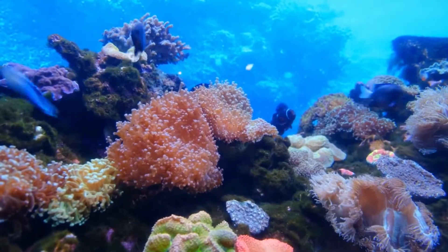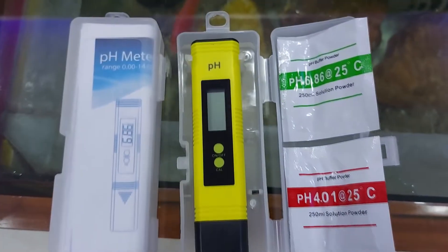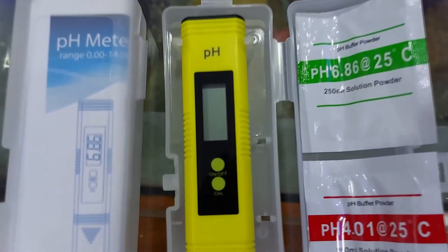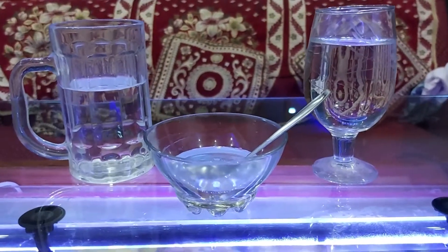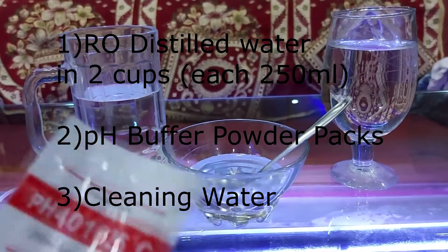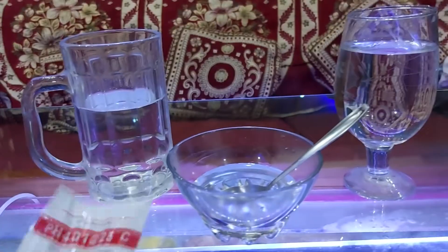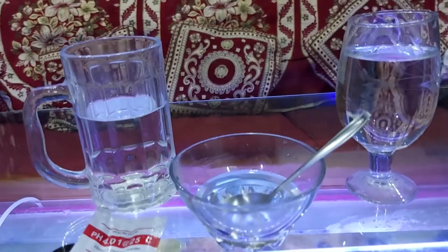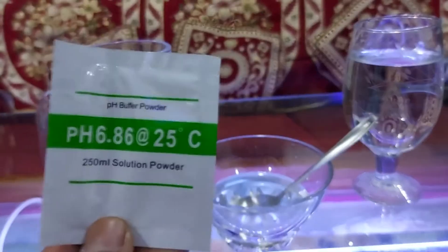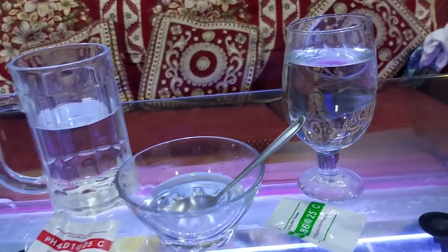Hello everyone, welcome to a new video of That Fish Place. In today's video we will talk about the calibration of digital pH meters. For this we will need 250 ml of RO distilled water — you can take the water from your Aquaguard purifier but it has to be RO water. You need RO water in two cups, and the third cup is there for cleaning.